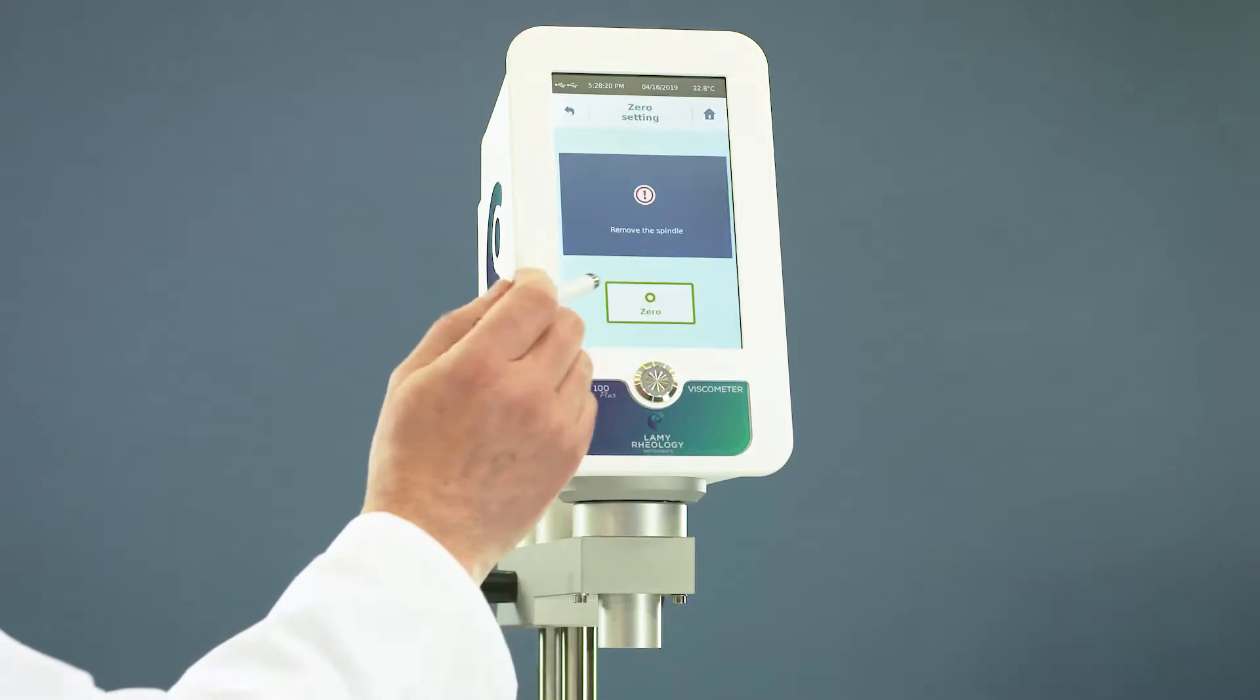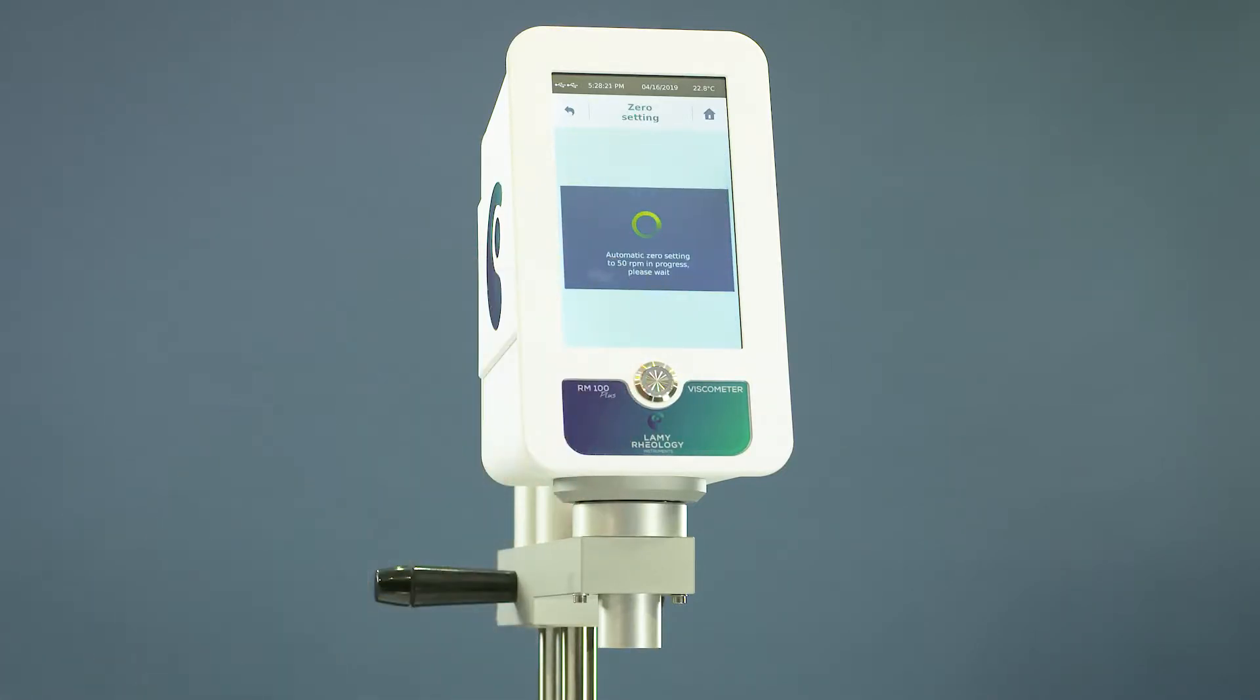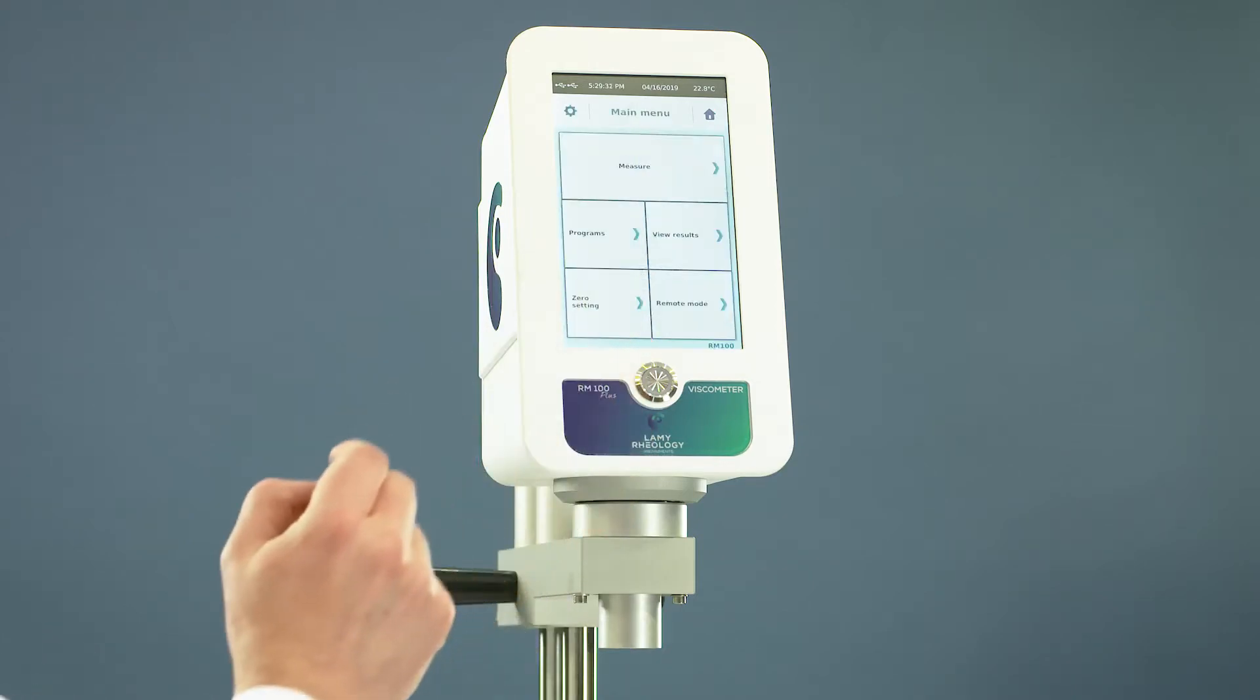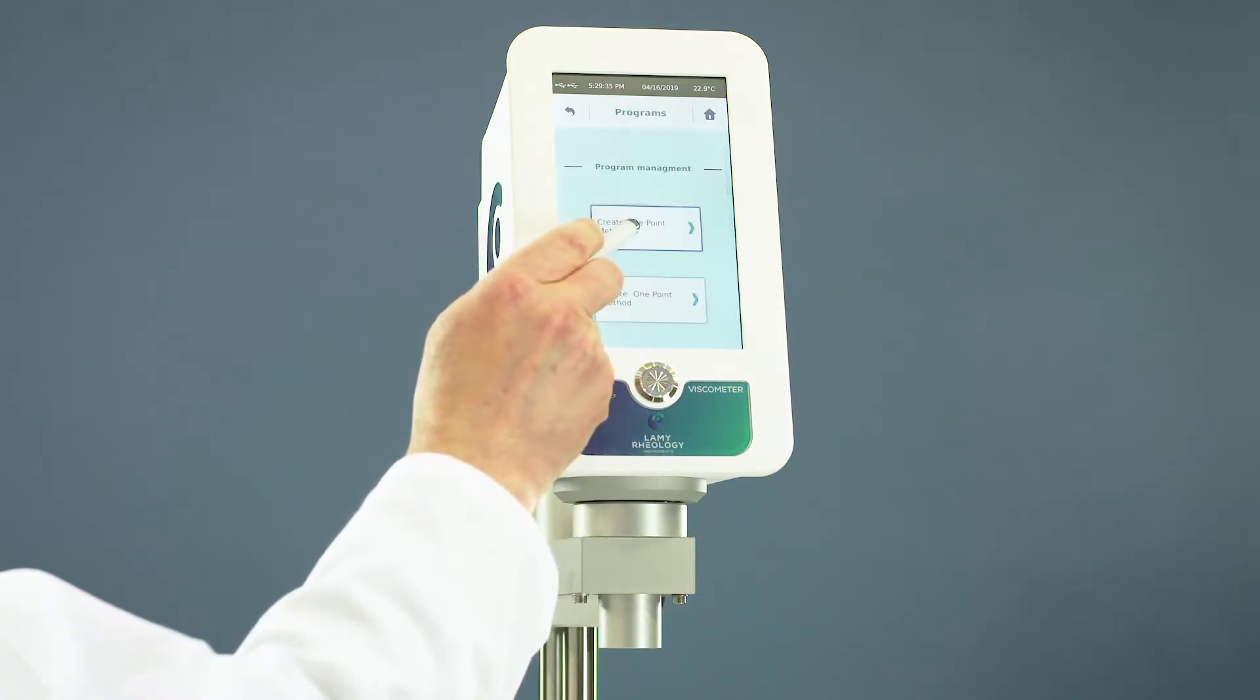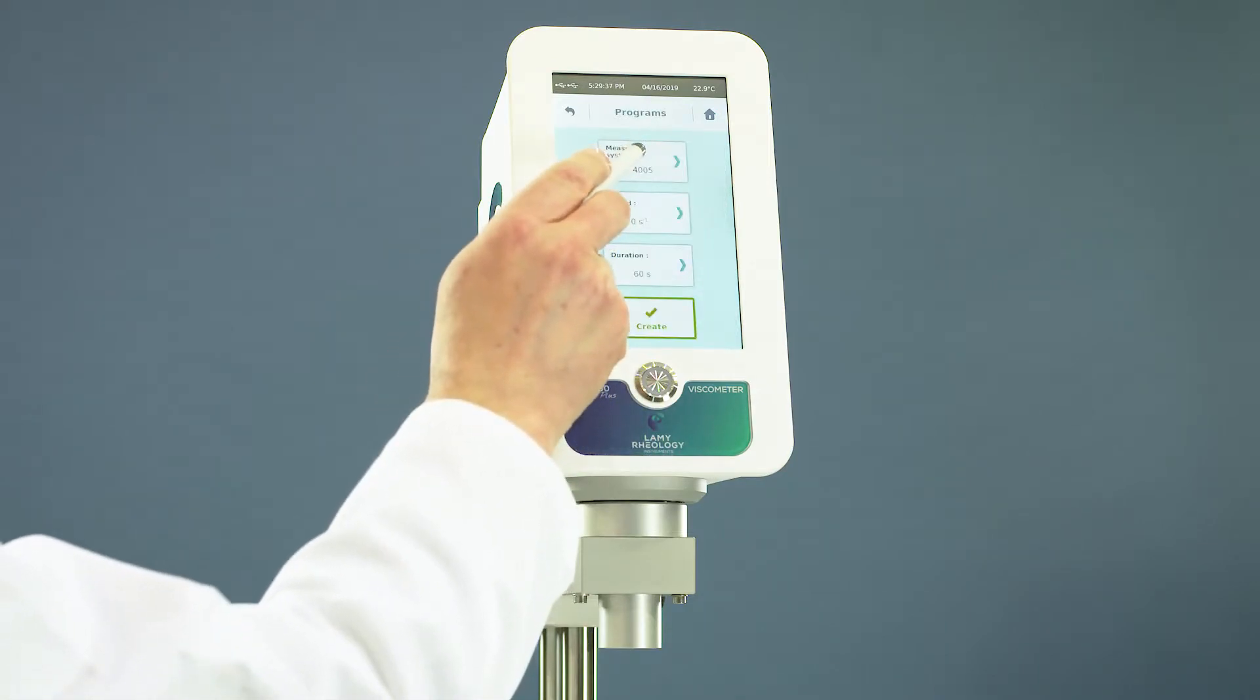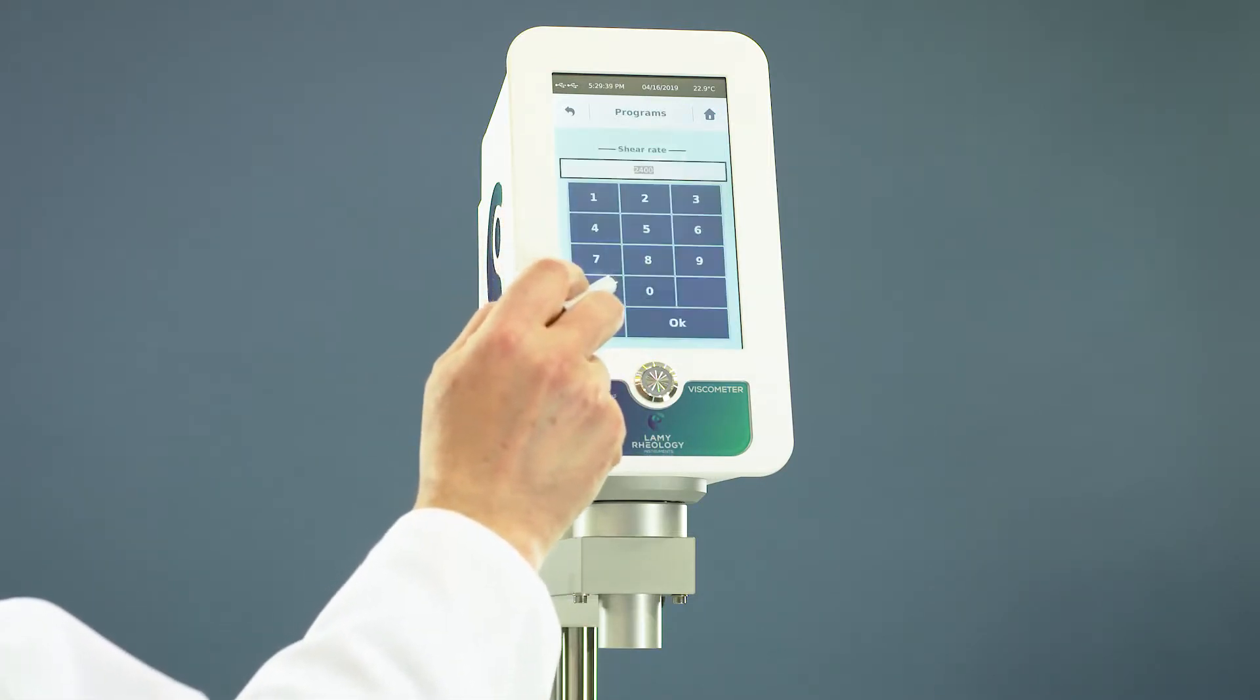Zero the device. You should make it at least once per day. Go to program, select the spindle, the shear rate, the duration, and save your method.